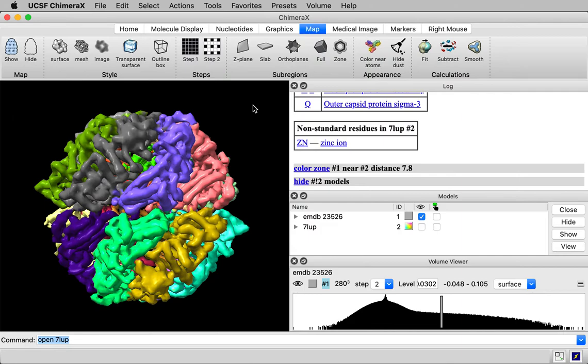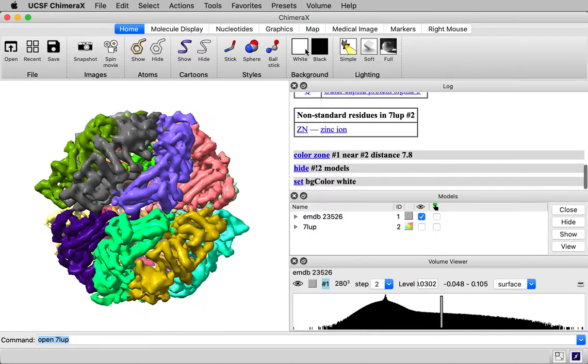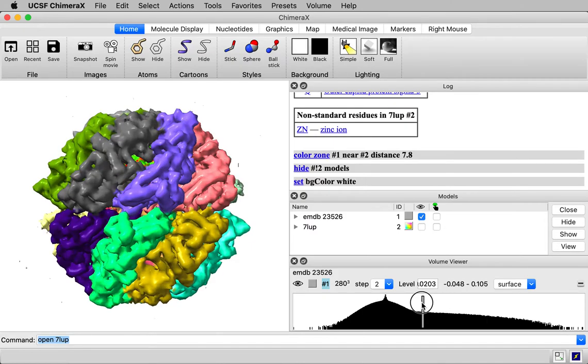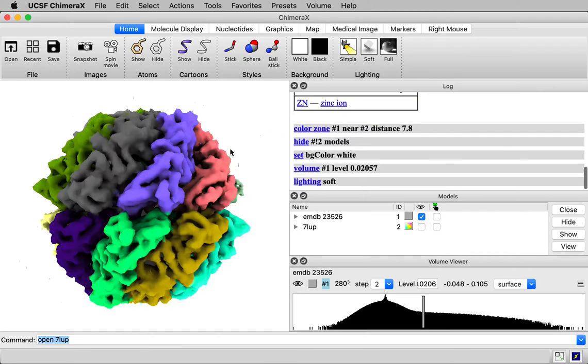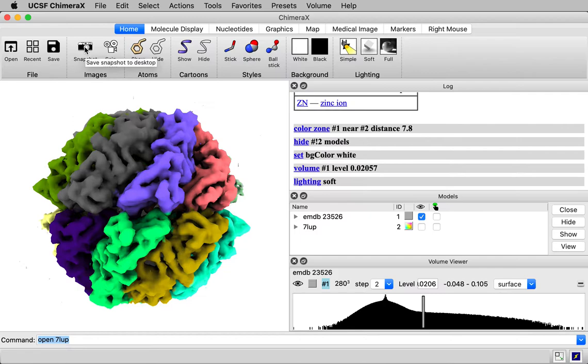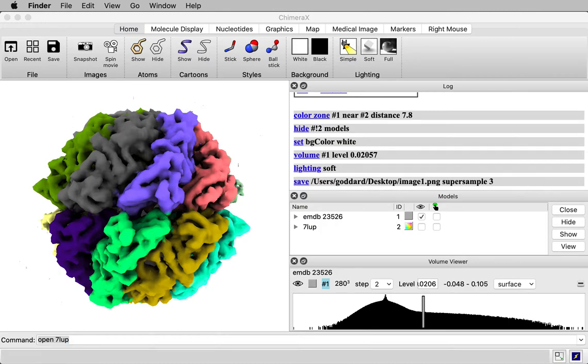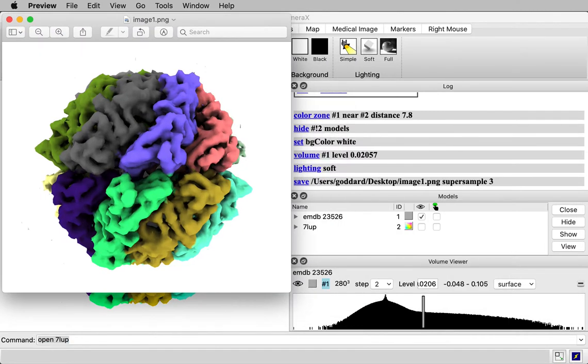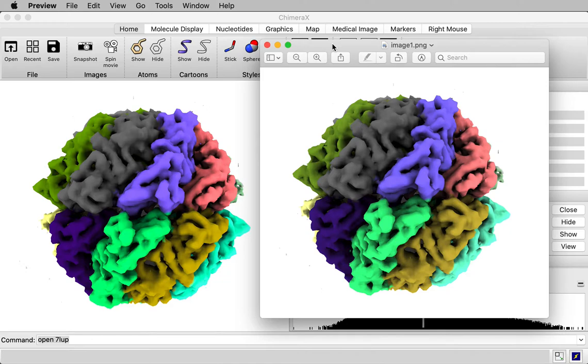So suppose I wanted to save an image of this. I could make the background color white. Let me go to the home toolbar, background color white. Maybe I'll lower the threshold level of the map a little bit. I might turn on the soft lighting to put nice shadows. And then this snapshot button will save an image to the desktop. Let me show you what that image looks like. Here it is. So it looks just like what you see in ChimeraX.